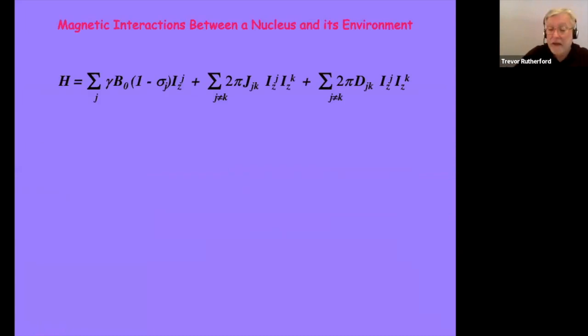So what's going to be quite useful is if we look at what are the basic principles that dictate what is in an NMR spectrum and what it contains. And where I'm going to start might look at first like it's quite complicated. It's the nuclear spin Hamiltonian describing the energy of a spin in a magnetic field, but I don't put that in there to make it look complicated. I put it in for exactly the opposite reason, to make it look very, very simple, because in fact, it's just a summation. Everything we see in NMR is a summation of three separate terms.